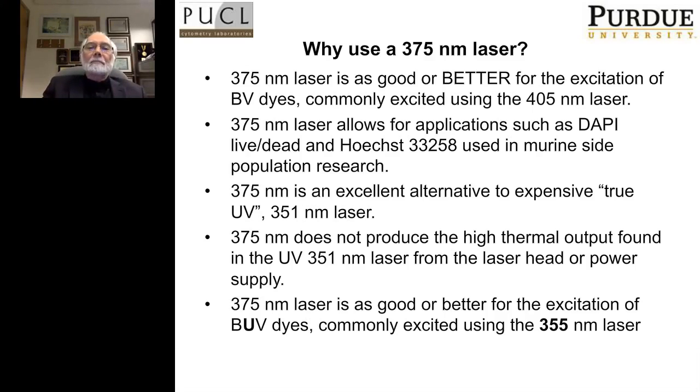But there are some advantages to the 375 laser because it may be even better at exciting some of these amazing brilliant violet dyes that are now available, and work very well with the 405 laser, and they may well work even better with the 375.